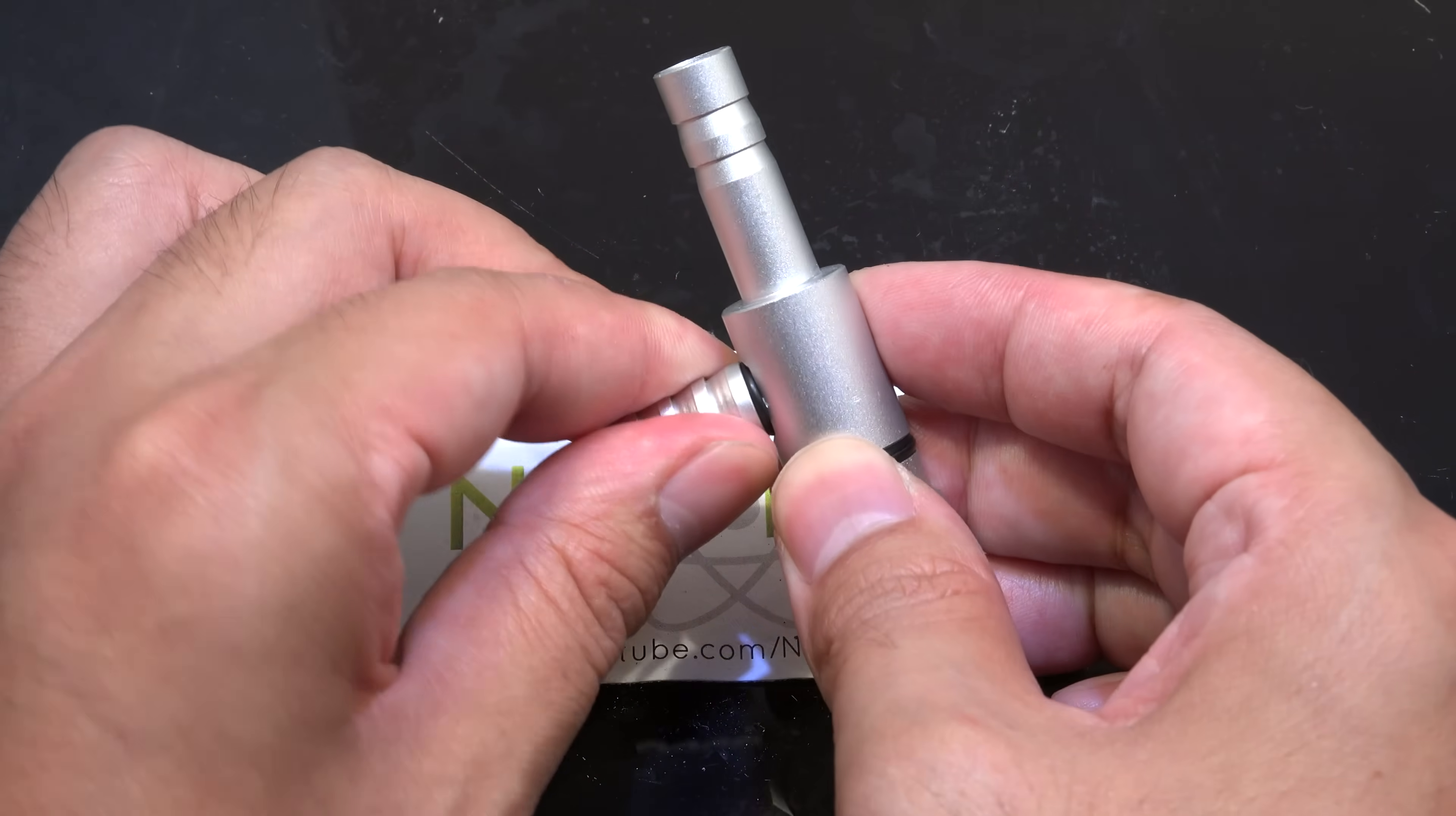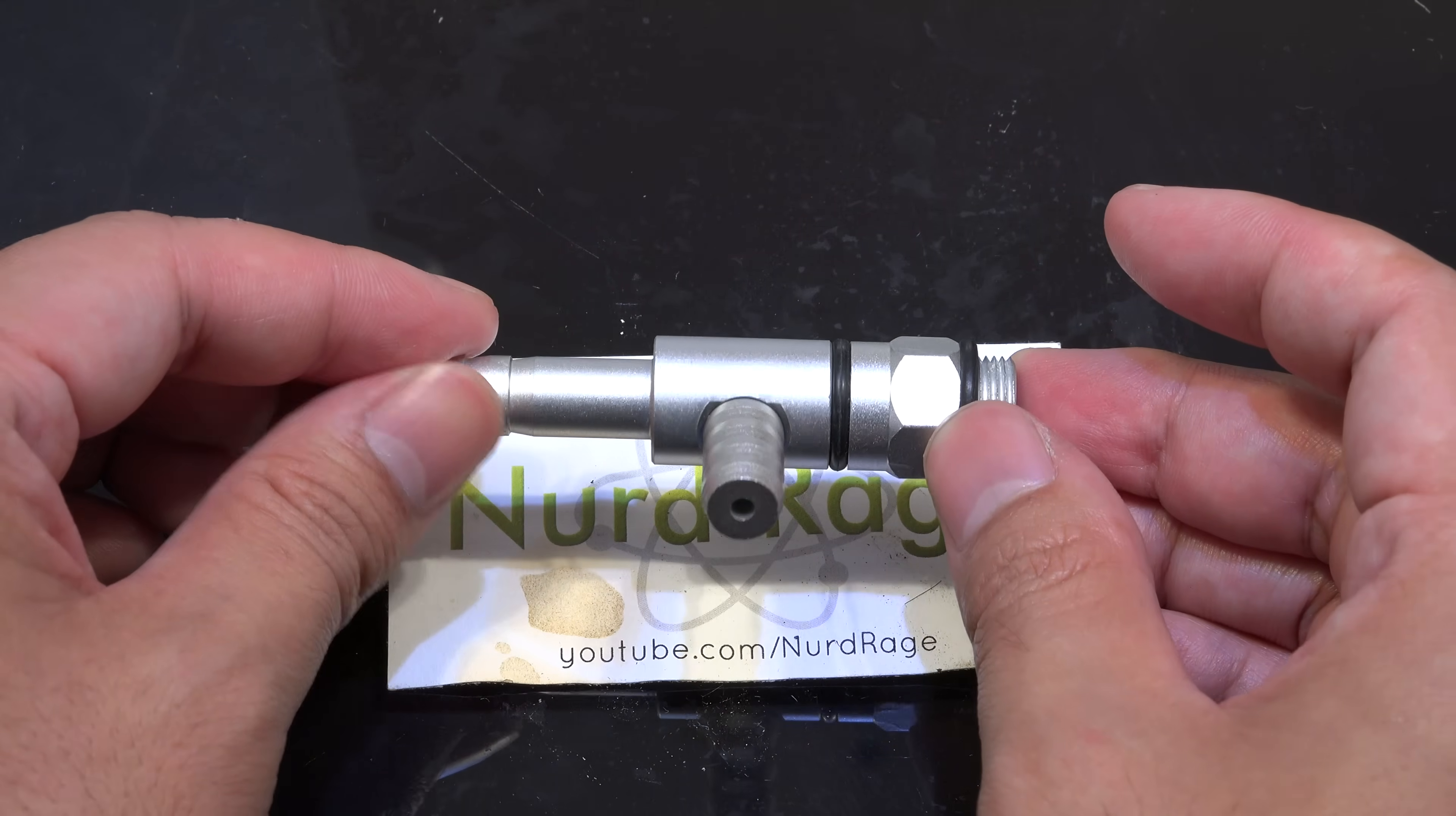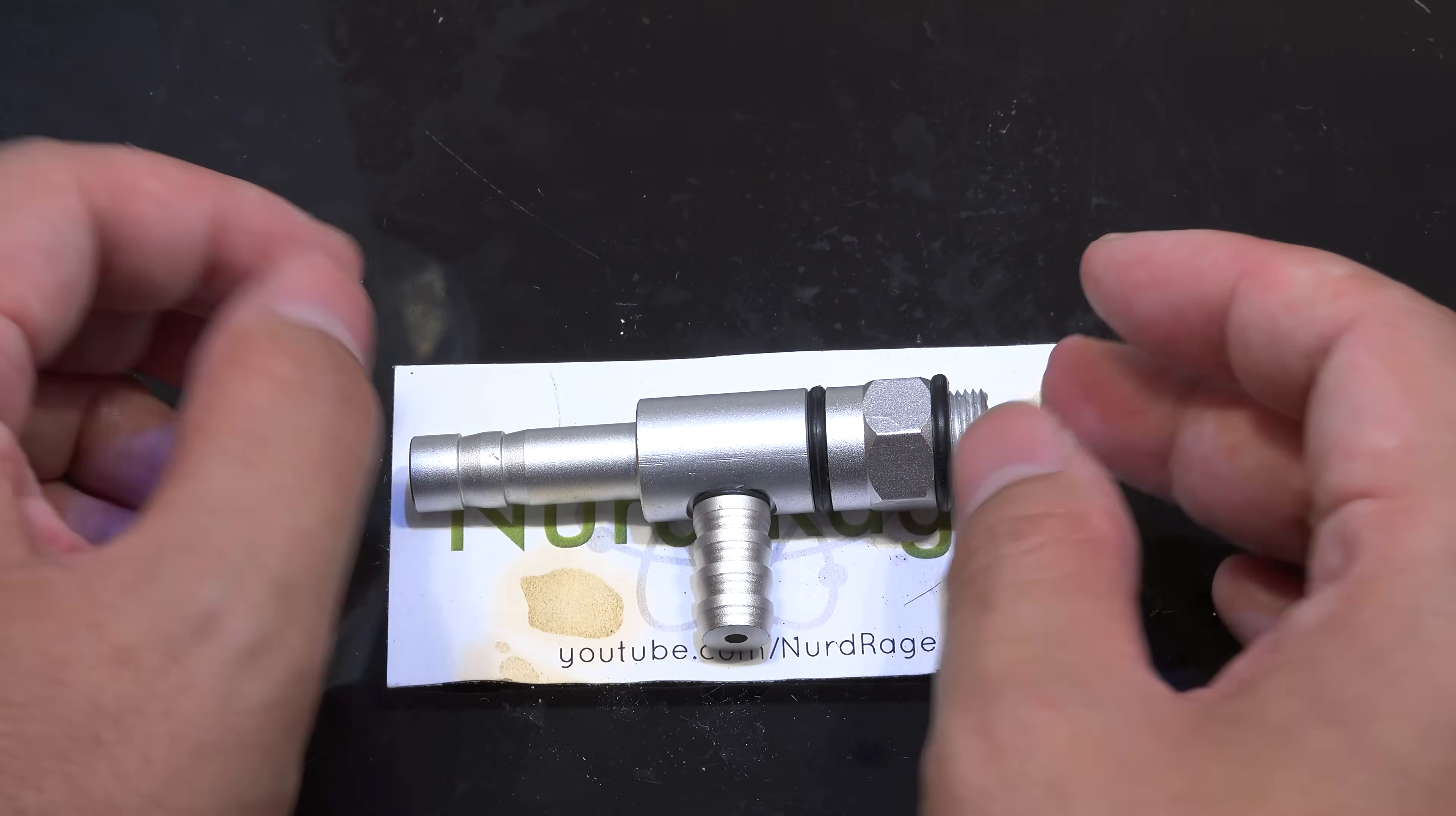It's a tremendously simple device that does indeed do a good job of providing vacuum. It also has the advantage of being very robust to chemicals.